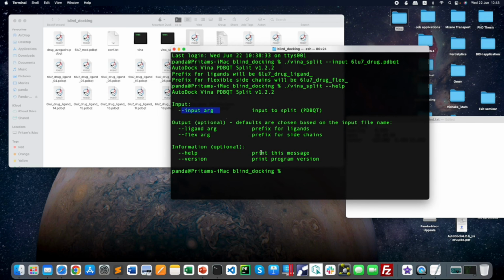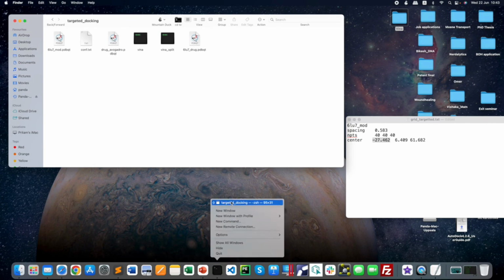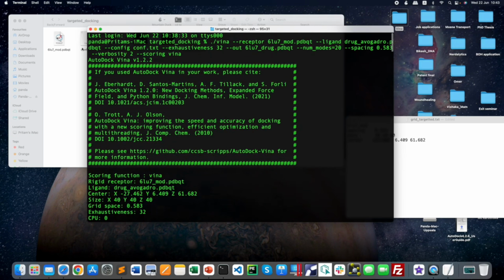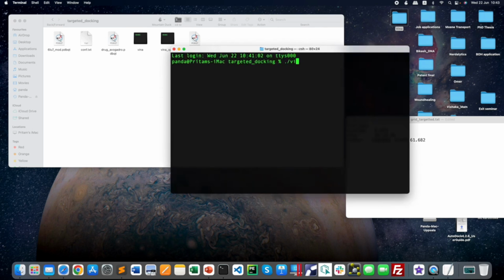So basically the command for vina_split is --input and your output file. The same we can do for the targeted docking. I think it is done. Let me see. Yeah, now you have the output. So you go the same here, vina_split --input 6LU7.